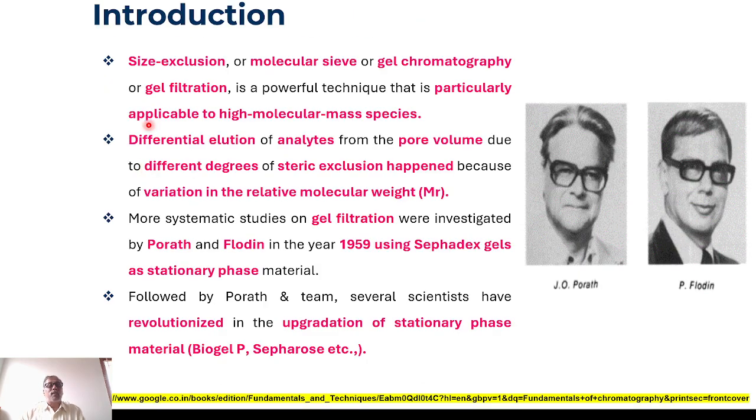This technique is actually termed size exclusion, molecular sieve, gel chromatography or gel filtration. Very famously, it is termed gel filtration. This is the most powerful technique used to purify or separate high molecular weight entities like proteins or polymers of carbohydrates.